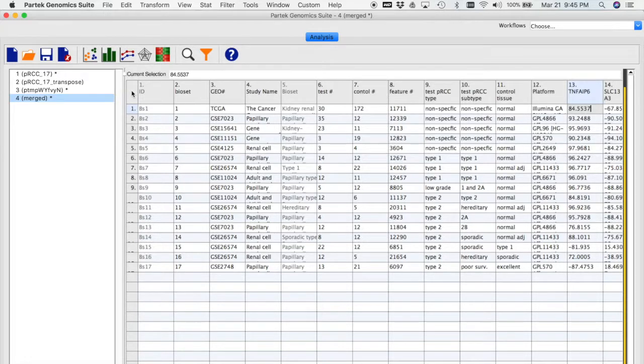Now let's start taking a look at this. Probably the best way to do that is through visualization. What I really like to look at whenever I get done with a data set is the PCA plot. So let's do that right now.